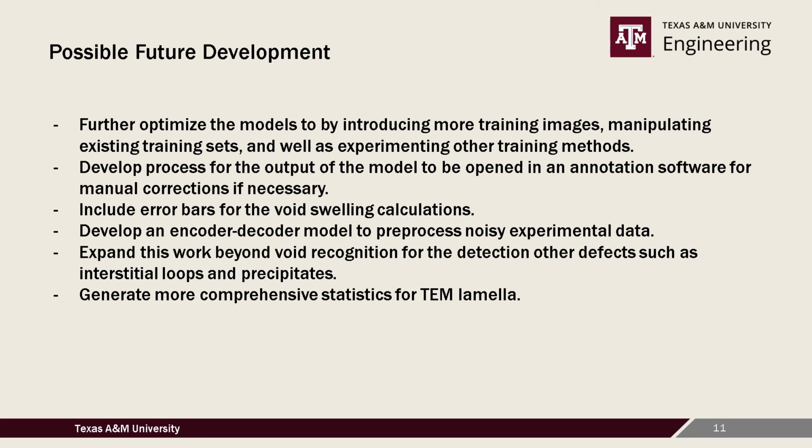This work can also be expanded beyond void recognition to include the detection of other defects such as interstitial loops and precipitates. In this process, more comprehensive defect statistics can be generated for TEM lamella.